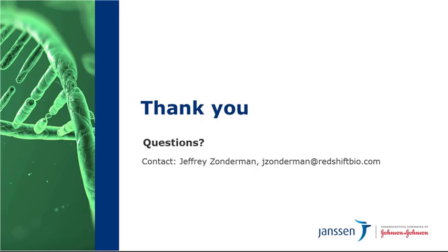Thank you very much, Steven, and for your presentation as well, Eugene. So our first question: how much optimization of parameters is needed before measuring each sample or spectrum and for each sample set? In my experience, it only took us about a morning's worth of work on individual samples to find some optimization conditions.